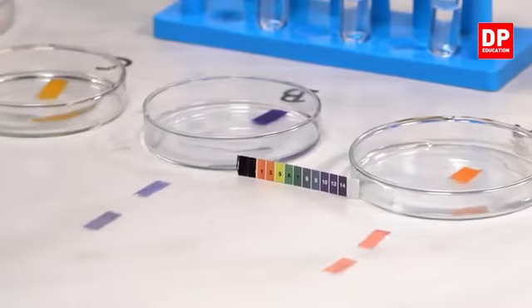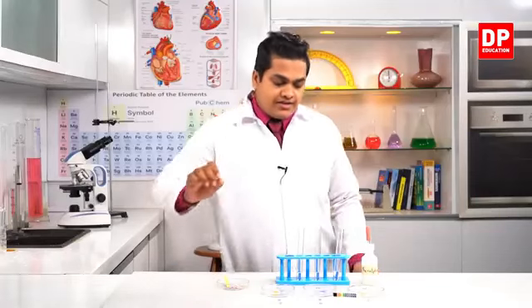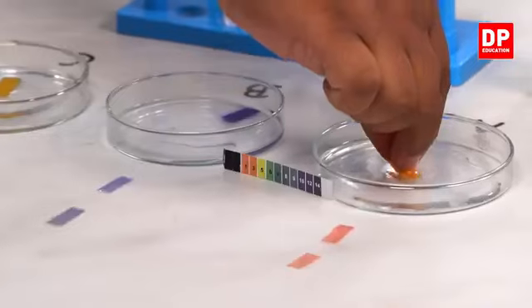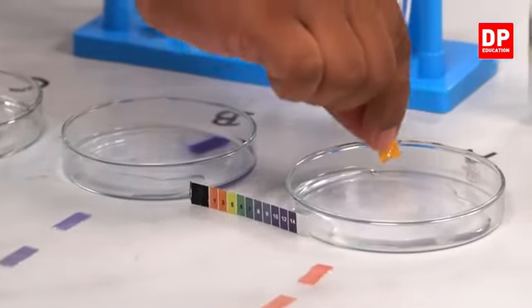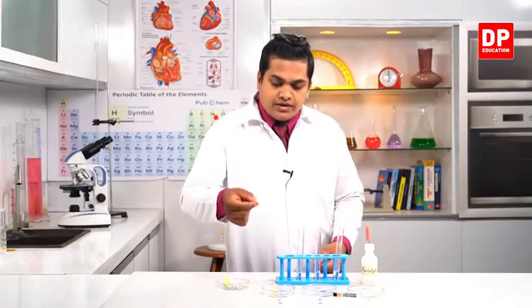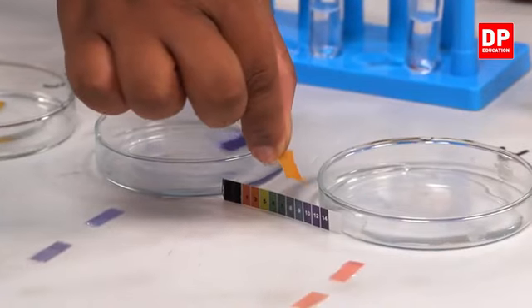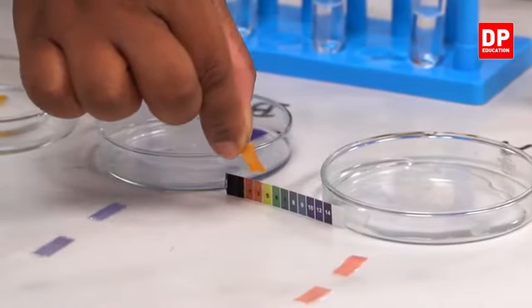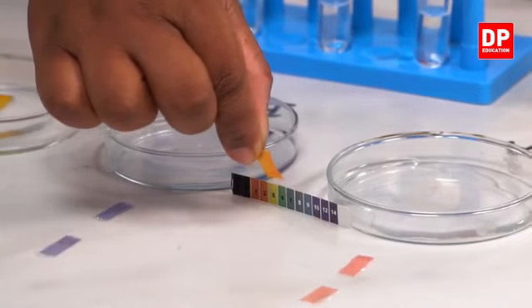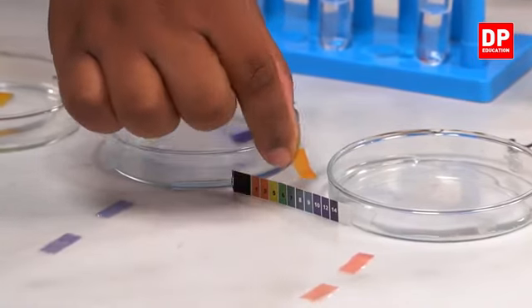Right, I'll place the indicator in front of you. Right, my dear children, now let's see the color change. So I have placed the indicator here. Now I'm going to take the pH paper and place it here. Let's see a value. So it's around between 3 and 5, right?